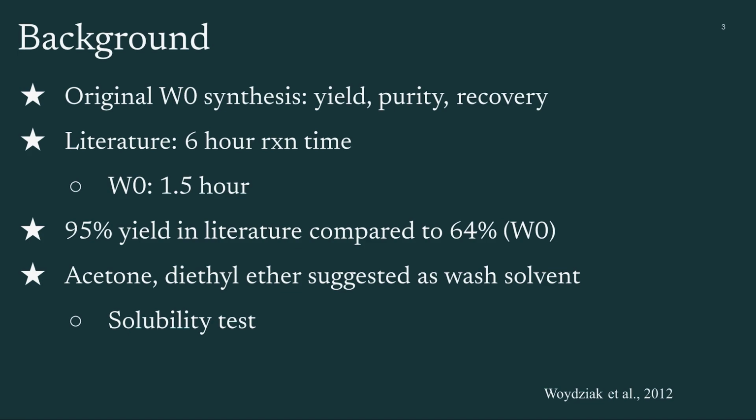Our week 0 reaction only ran for 1.5 hours compared to a 6-hour reaction time in our literature that gave about a 95% yield compared to our 64% yield in week 0, which is obviously quite a bit lower. That raised the question of whether the shortened reaction time was limiting our yield or purity. So we decided to increase that for this test.